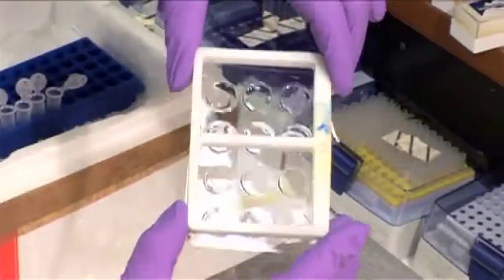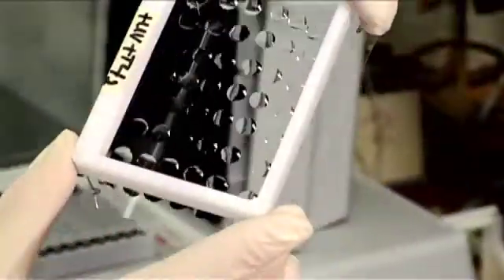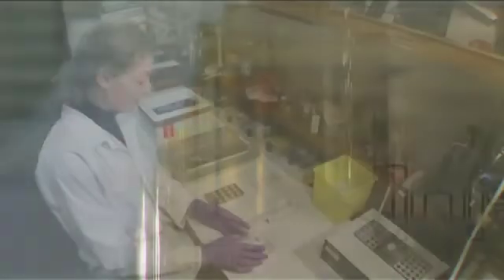As an alternative to making gels on slides, you can use gel bond plastic film. We will show how this film is used to set either 12 or 48 gels on one sheet of film. Lysis, enzyme digestion, alkaline treatment and electrophoresis follow, as with glass slides. 4 sheets can be fitted into one electrophoresis tank, so up to 192 gels can be processed in one run.